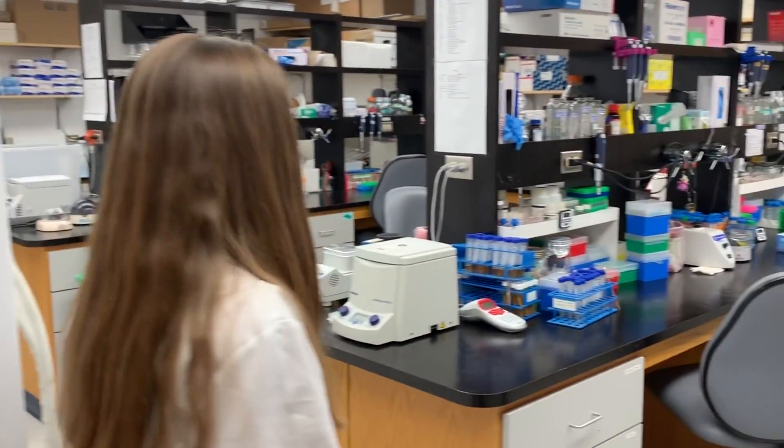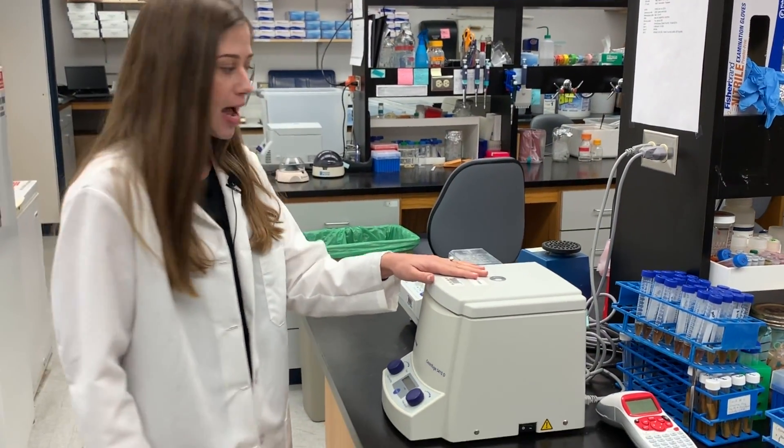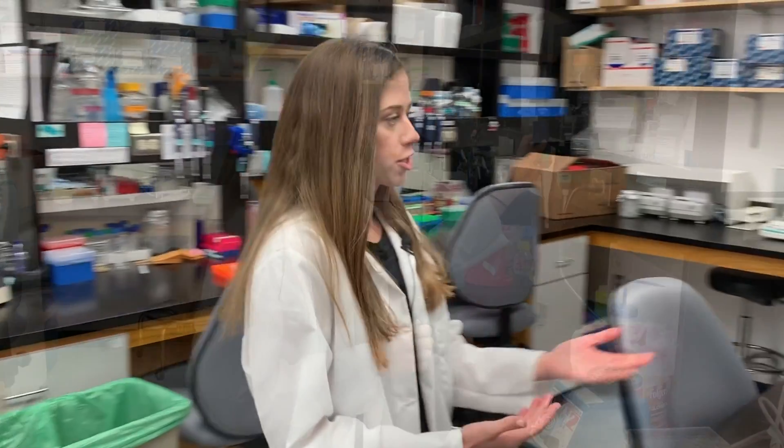In here is our wet lab. That means that we do all of our reactions involving DNA extractions, RNA, or protein work, as well as mixing different chemicals in this room. We have a lot of equipment that we use to spin things down, to mix things up, heat them up, and also just to measure and pour.